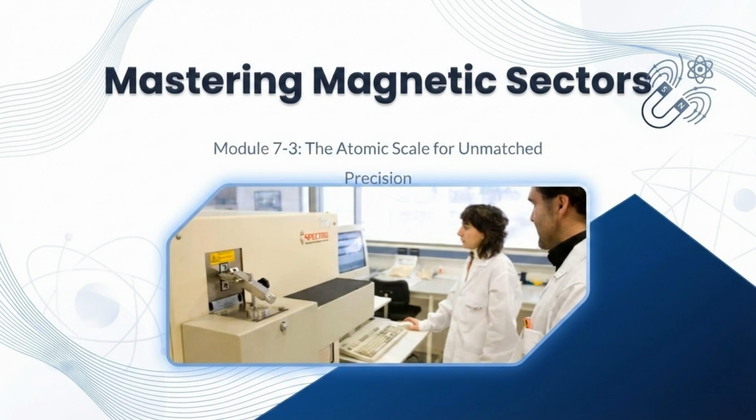Have you ever wondered why some measurements are considered good enough, while others require what we call unmatched precision? In the world of chemical analysis, there is a distinct line between a general survey and a definitive measurement. Today, we're going back to the roots of mass spectrometry, the magnetic sector, the gold standard for isotopic ratio analysis.